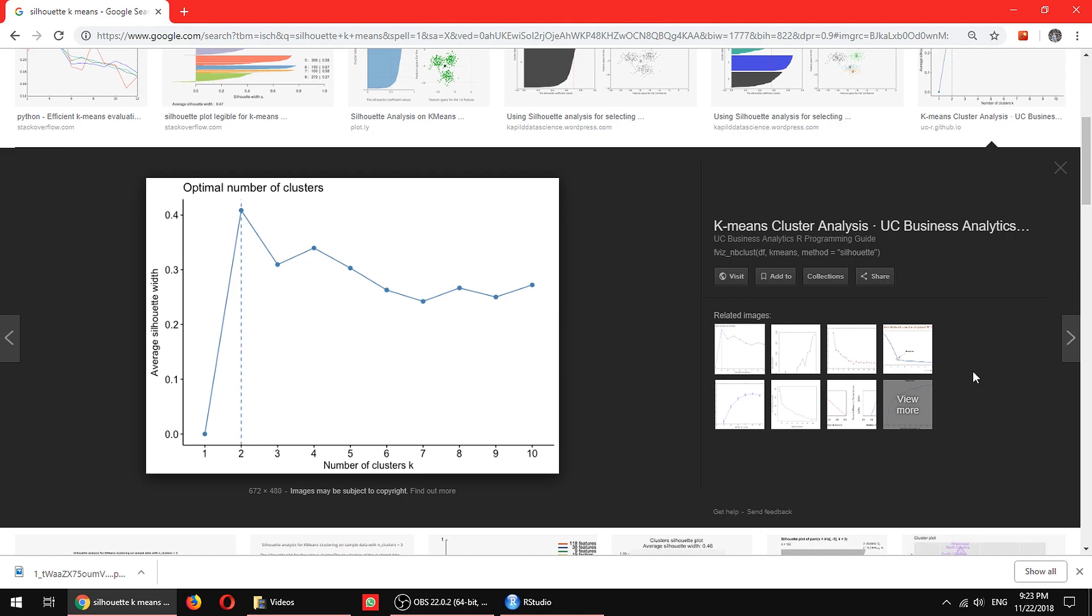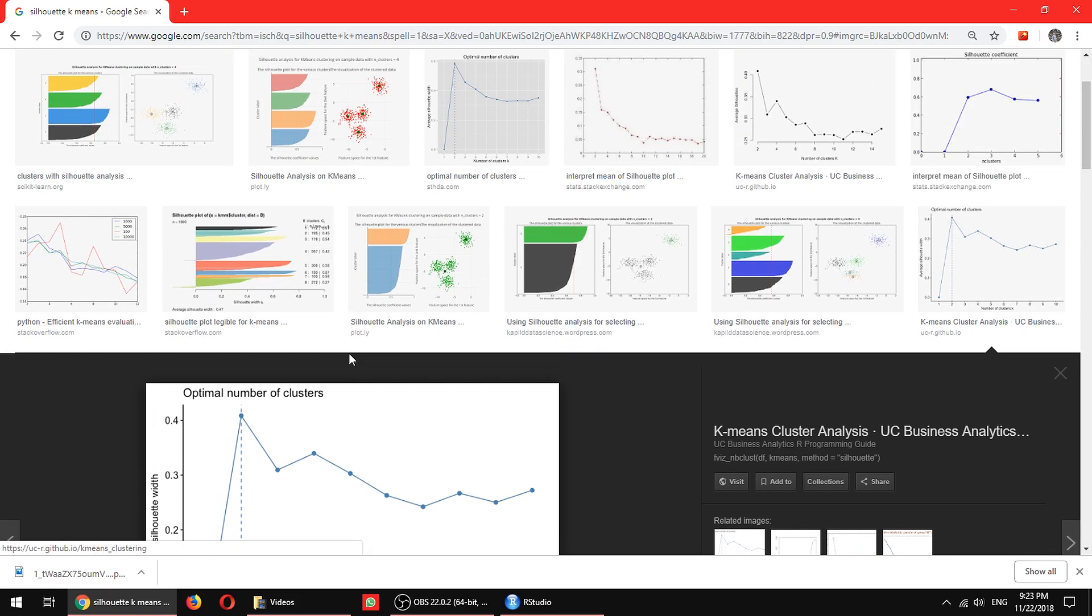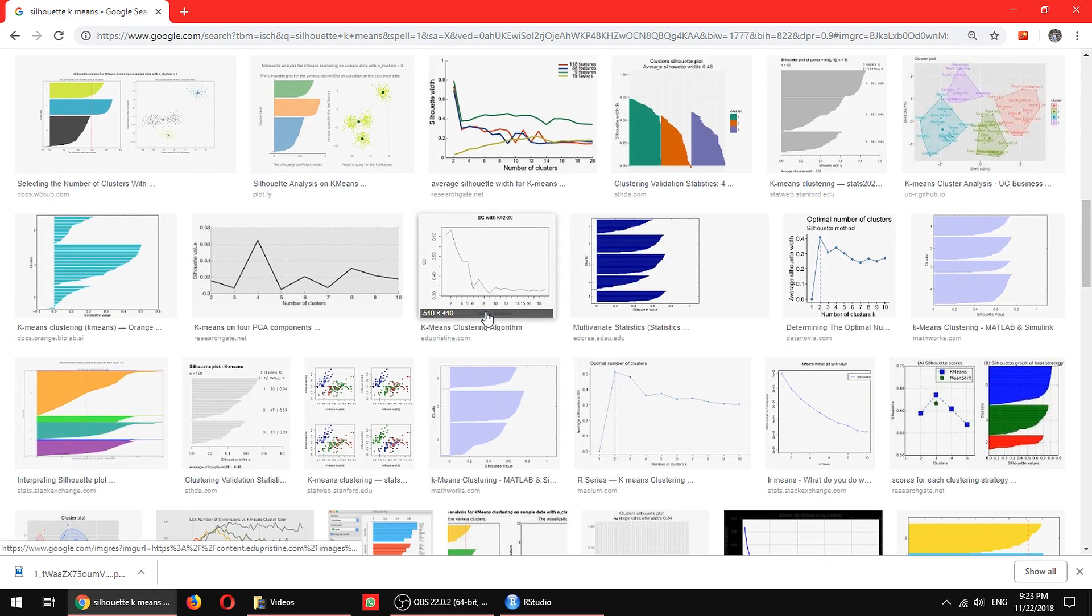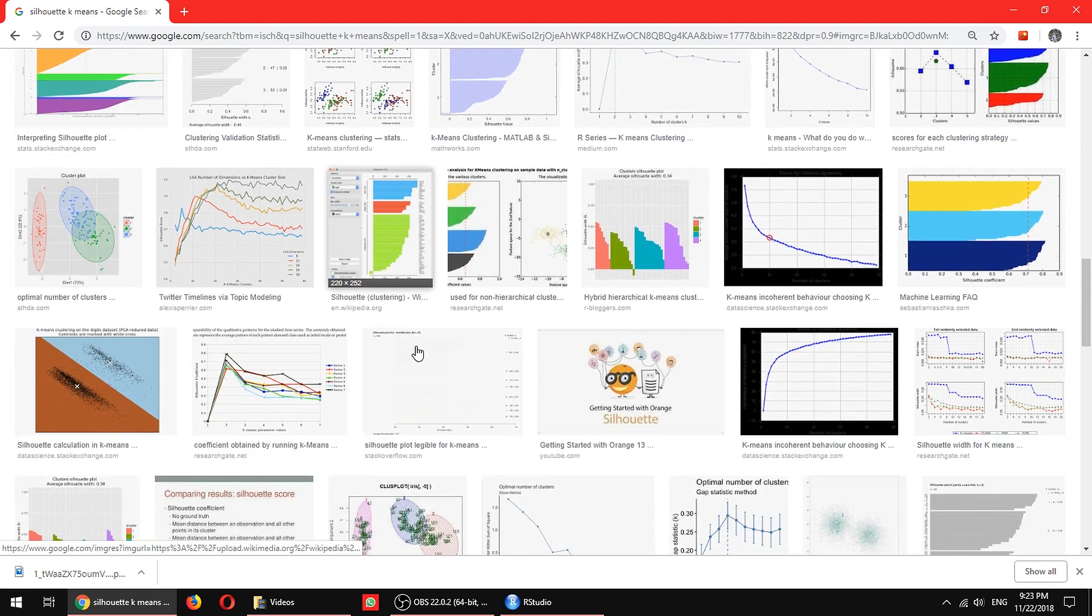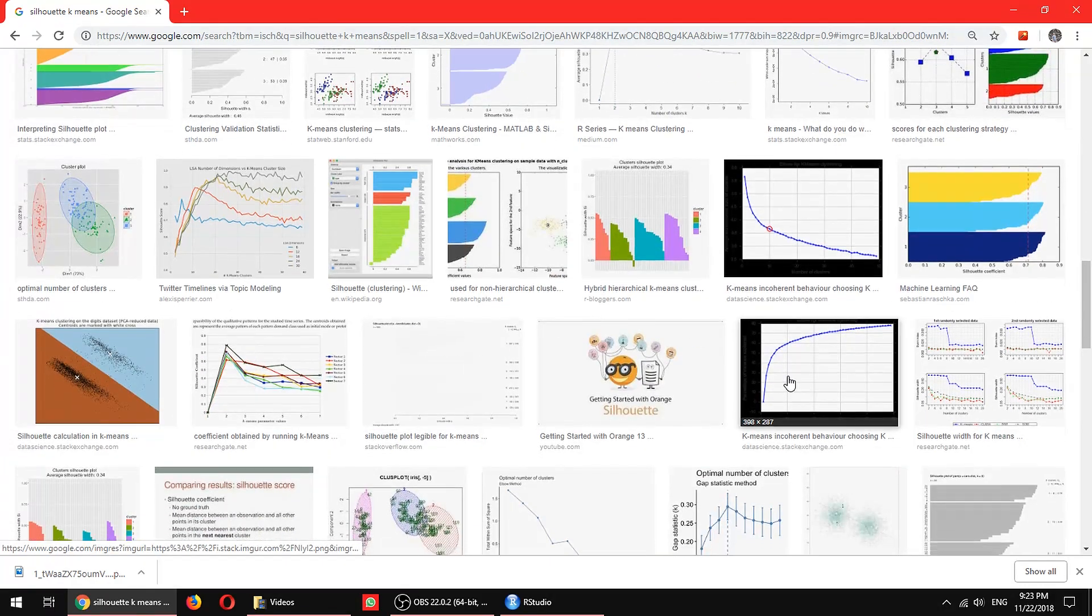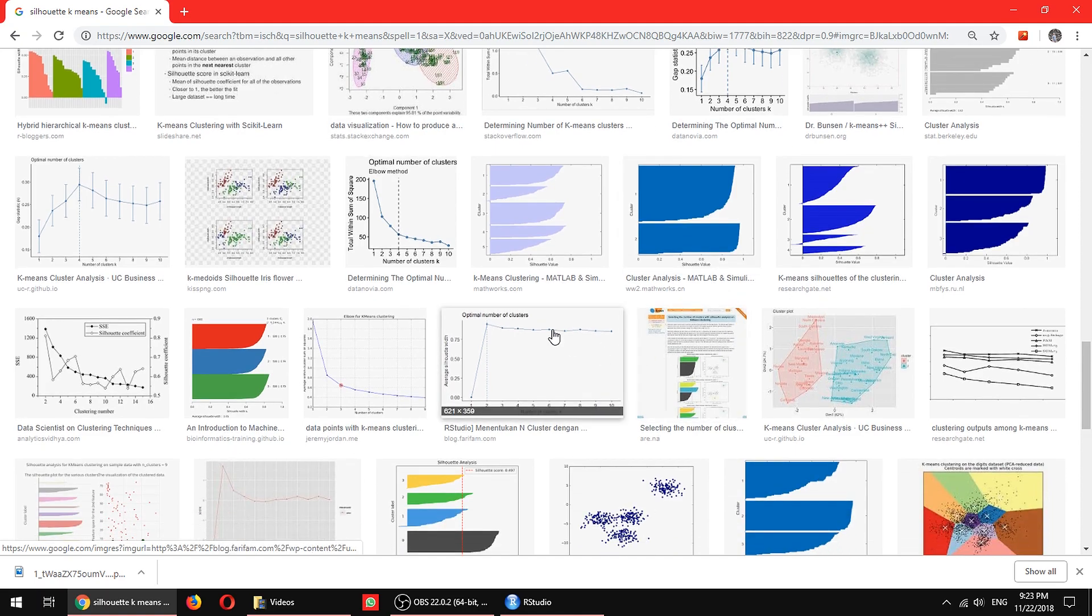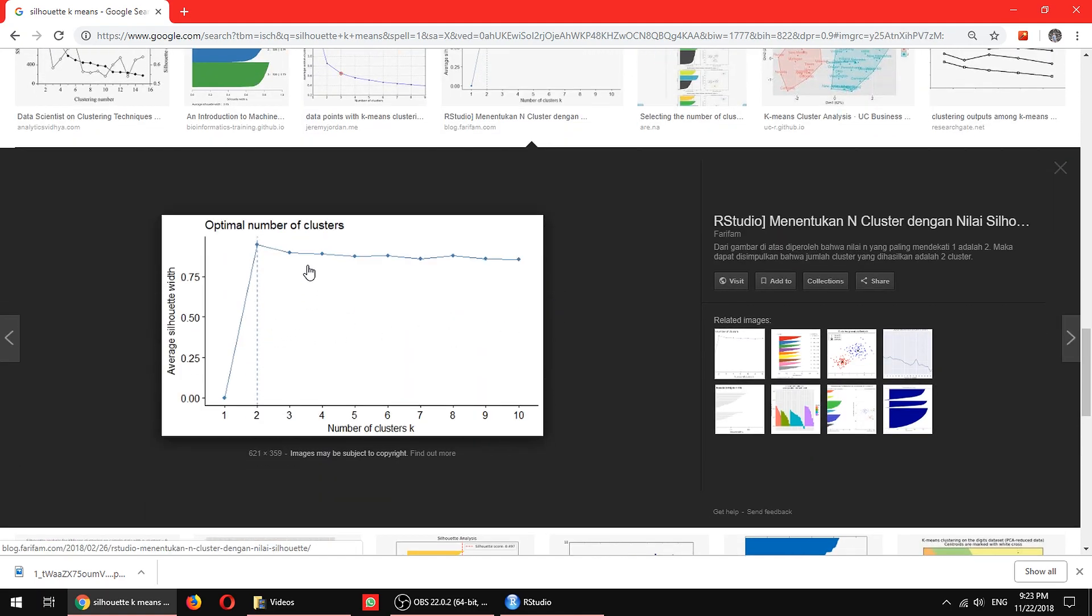So silhouette method is slightly different from the elbow method. It turns the data the other way around. The good thing about this is that it will actually just label it on the graph directly on how many clusters you should have. There's more examples. The optimal cluster would be above here.